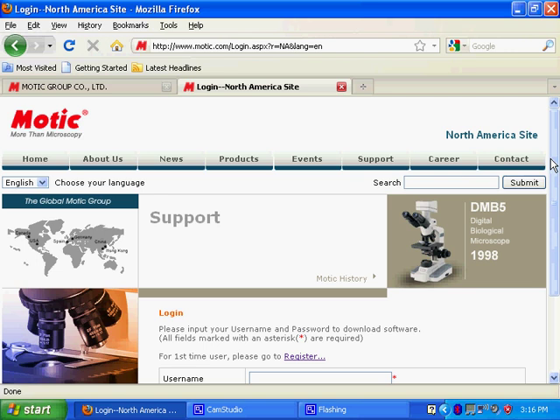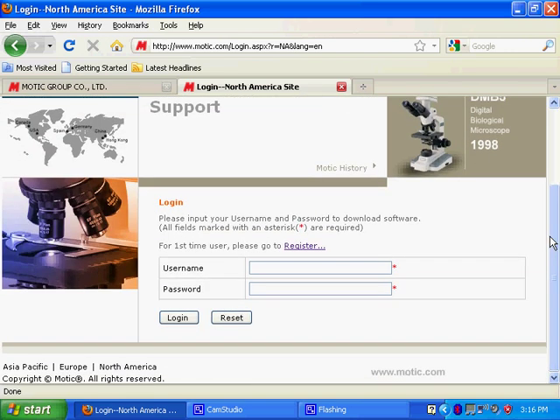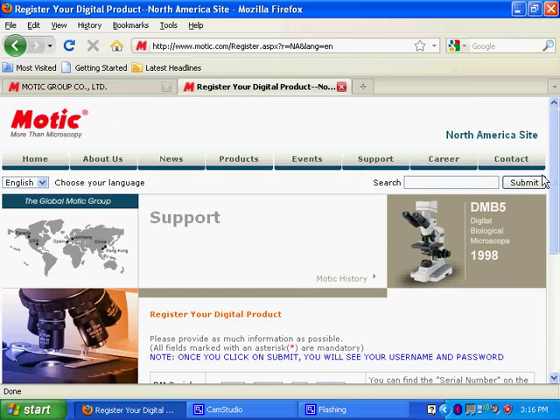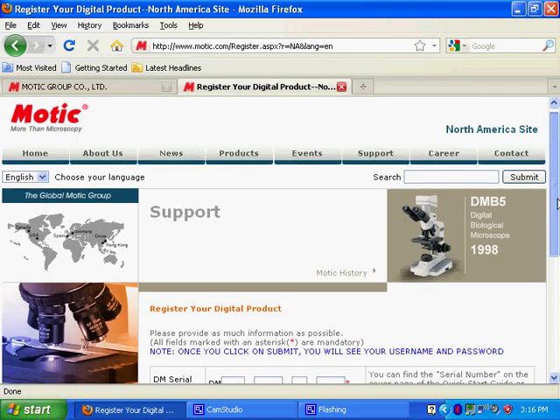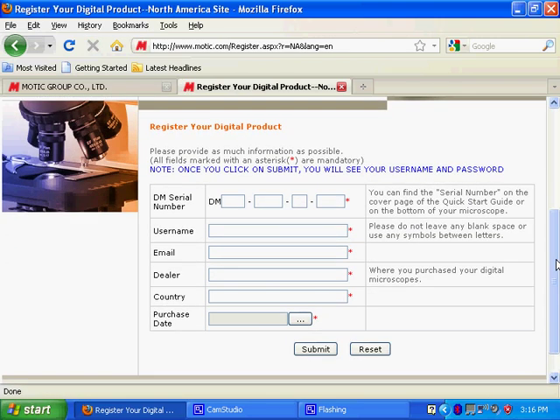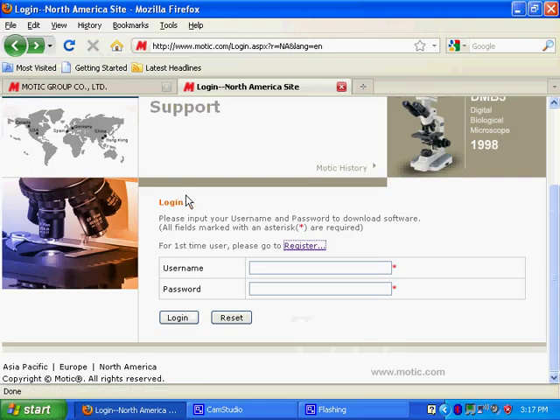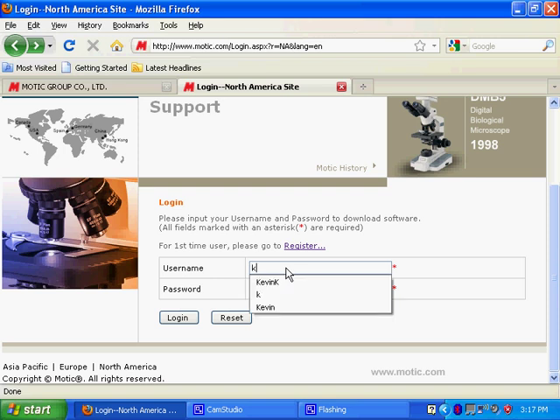If you have not logged in or registered your product, please do so. You will need the DM0 number that is on the bottom of your microscope or on the CD Packaging. Enter it there and enter all the other fields. Once you have logged in, you can proceed on to downloading the software, which I am going to do right now.